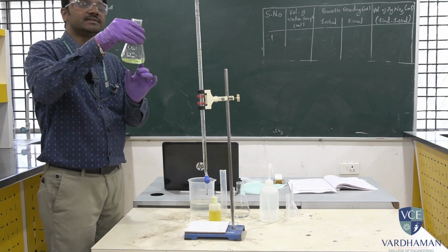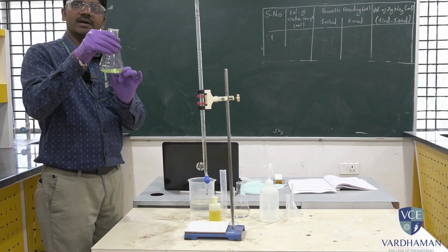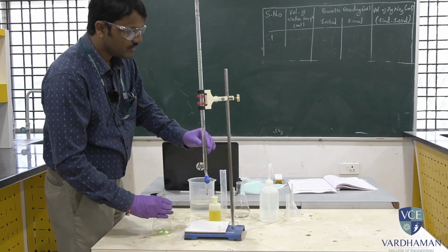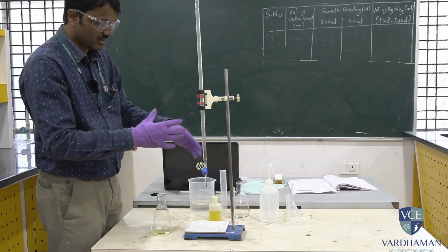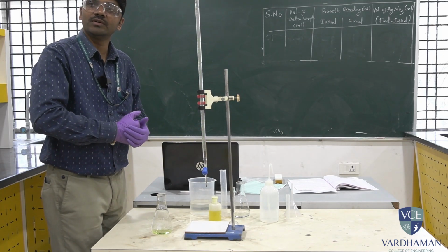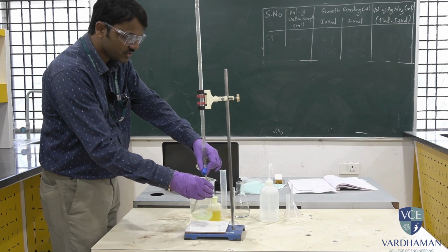Now you see the solution color is yellow. Why yellow? Because of the indicator. This is a standard silver nitrate solution, already filled. The concentration of silver nitrate is 0.014 normal. Now titrate against the silver nitrate solution.